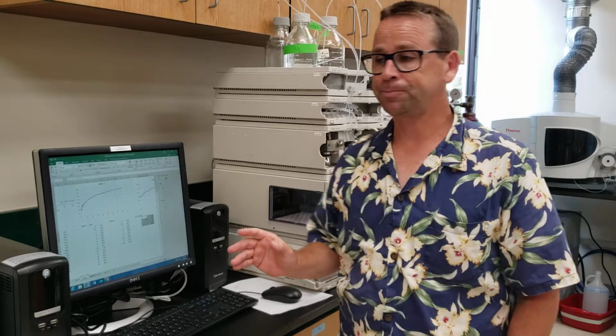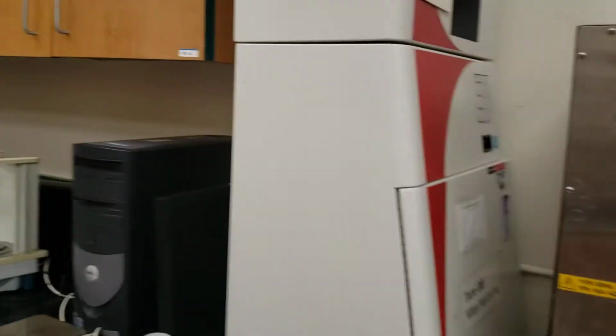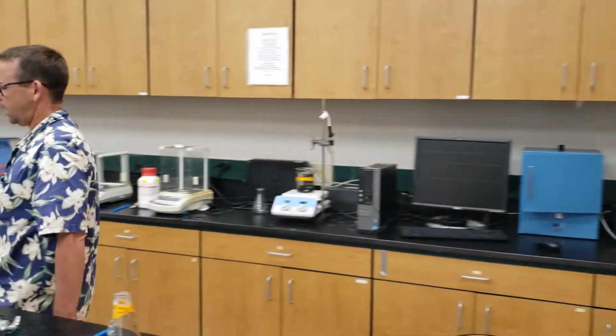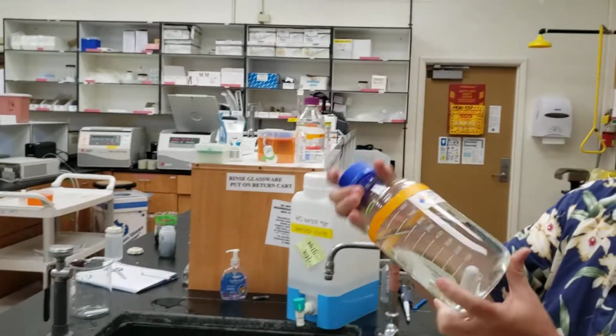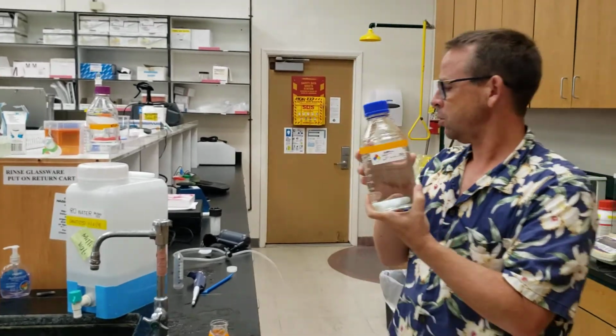we also took our pump here, and we tried to take 2.5 millimolar copper sulfate. So here's 2.5 millimolar copper ion, which we tried to filter.